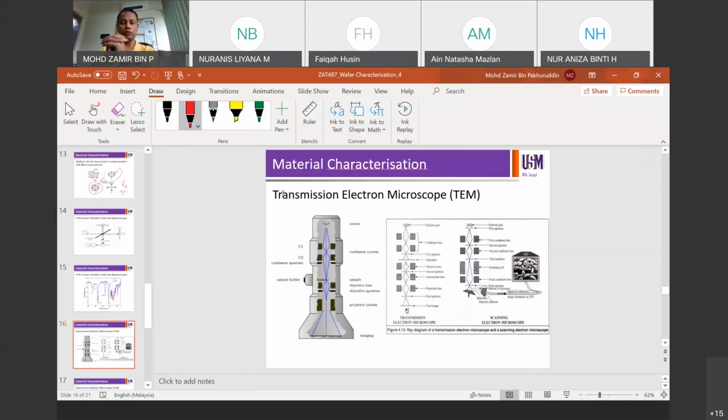So if you work on quantum dots, for example, you can actually measure the size of the dot. With SEM, usually you can go down to around 100 nano or slightly less than 100 nano at best. In our knowledge of the tool, typically you can go slightly below 100 and then it will lose its resolution. That means you cannot see your surface or your particles clearly because it loses resolution at a very low size. But if you go for low sizes which SEM cannot capture, you can go to TEM. You can pinpoint the diameter of your dots, maybe of your particles, down to 1-2 nanometers. Very, very powerful.